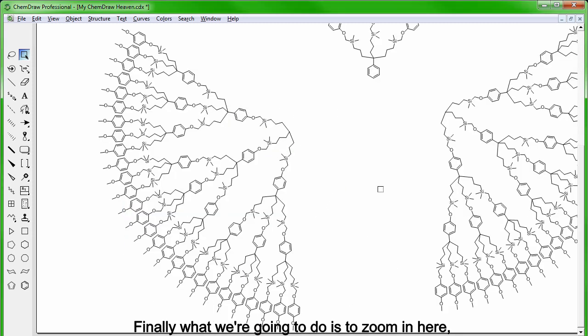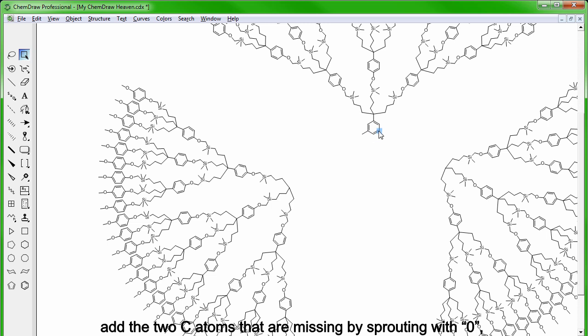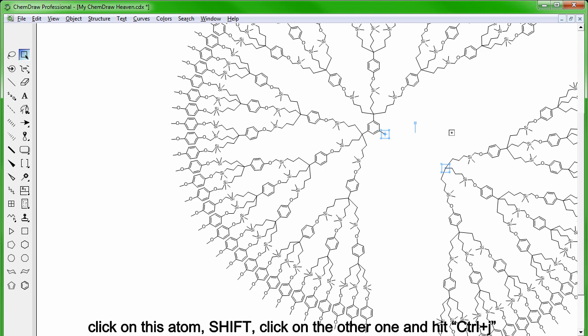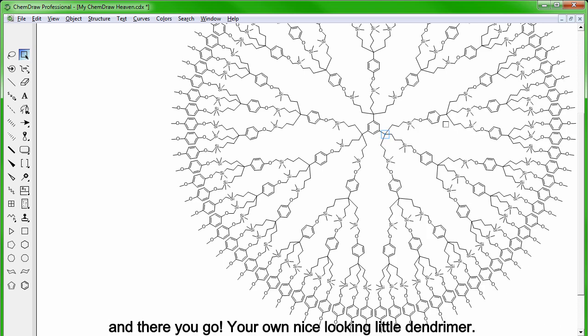Finally, what we're going to do is zoom in here, add two carbon atoms that are missing by sprouting with zero and then select this one, hold SHIFT, select the other one and hit CTRL-J. Remember the first one does not move and now one last time, click on this atom, click on the other one and hit CTRL-J. And there you go, your own nice looking little dendromer.